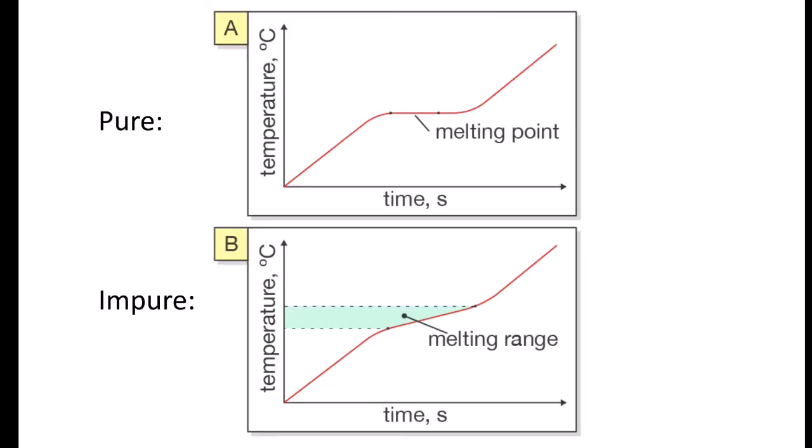So for example, you want to extract and isolate caffeine from coffee beans. You performed all the extraction and isolation methods and end up with a white powder. If your collected substance matches the melting point of caffeine in the MSDS, then you can conclude that the identity of your compound is probably caffeine.